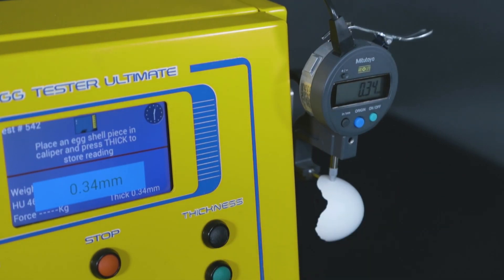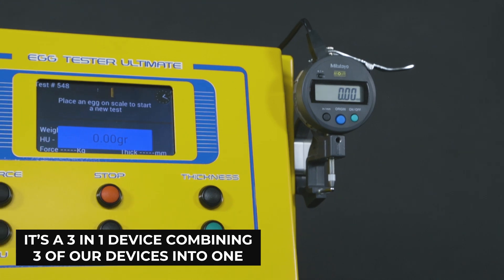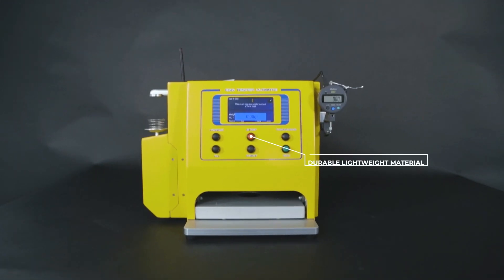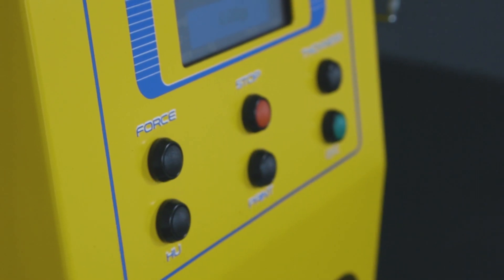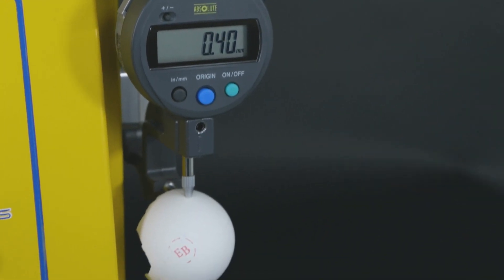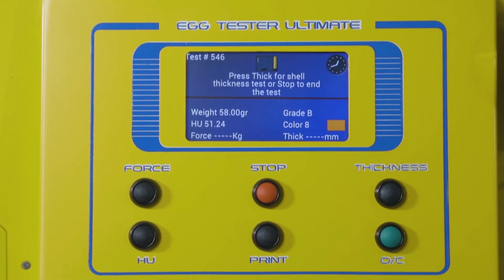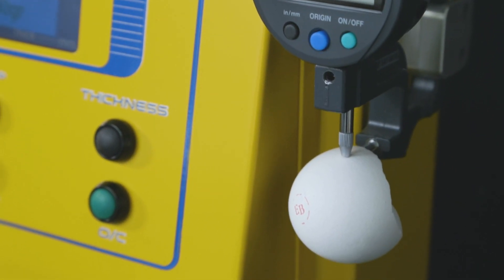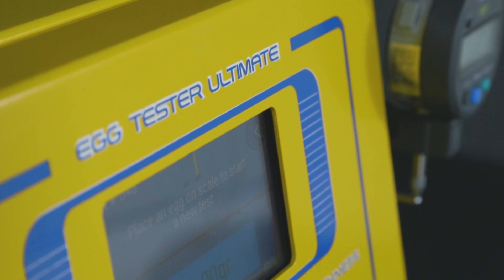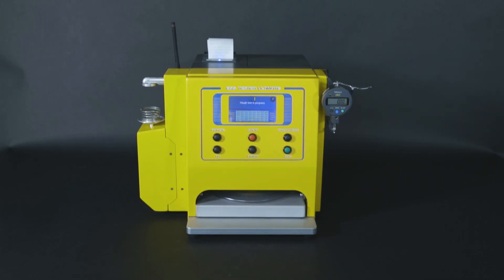It's a three-in-one device combining three of our devices into one. It's built using durable, lightweight material so you can transport it with ease, packed with state-of-the-art technology to ensure more accurate results than ever possible before. Traditionally, similar devices need to ship back to the manufacturer to be recalibrated — with the Egg Tester Ultimate, calibration is no longer needed.